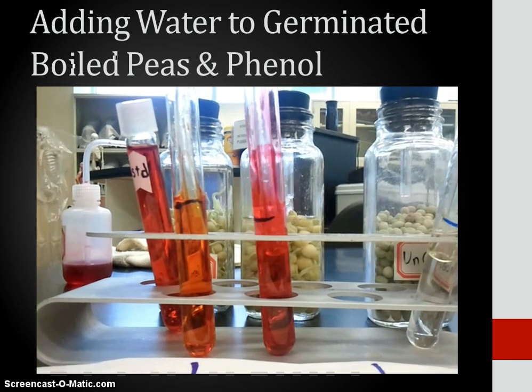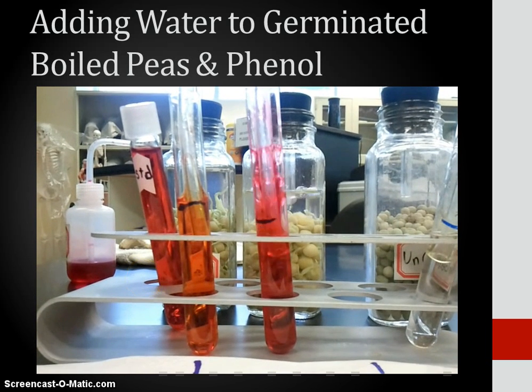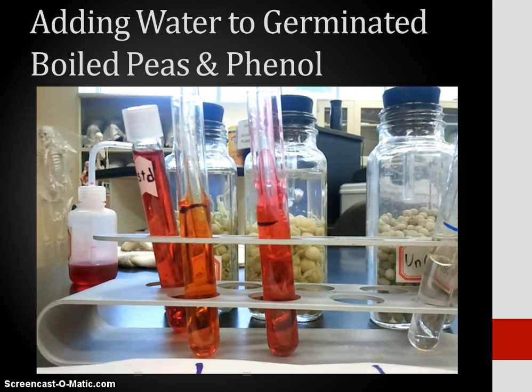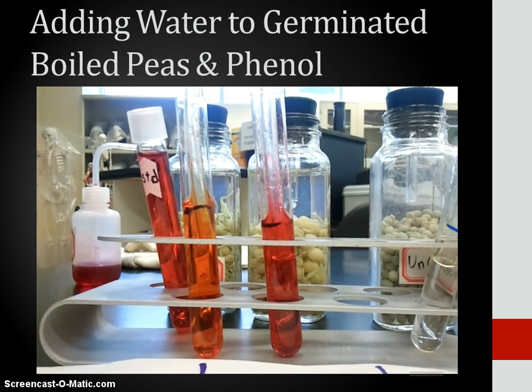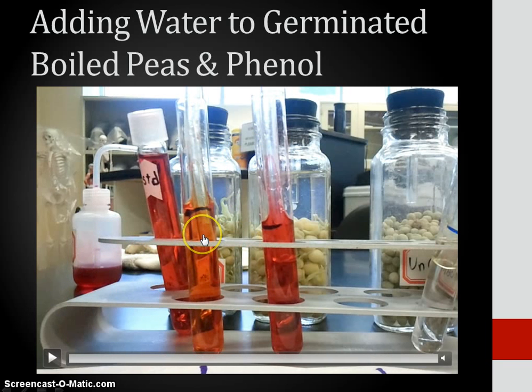This video shows us adding water to the germinated boiled peas, and we can see that yes, it's bubbling, and there are bubbles, but there is no color change. All we see is red, there is no apparent yellow. So what does that mean? Again, no carbonic acid is shown here, but in the germinated peas, there was carbonic acid because it turned yellow. But germinated boiled, no carbonic acid.